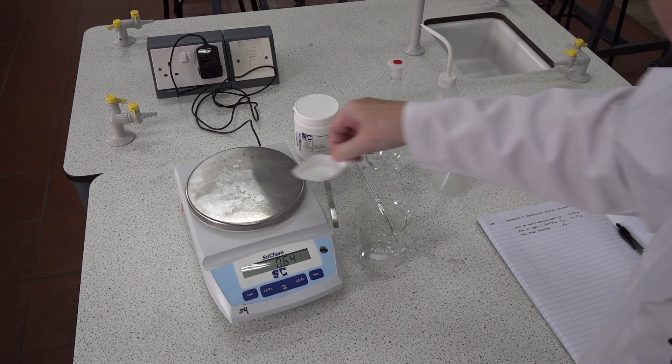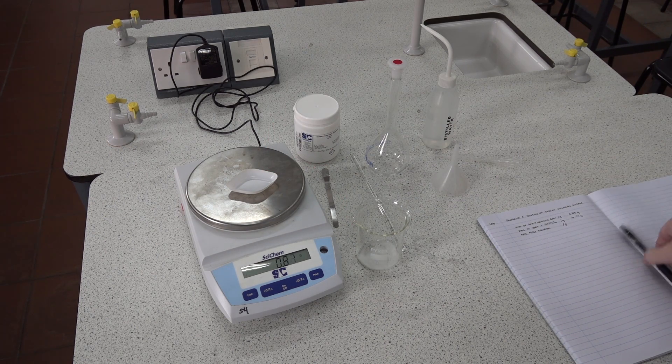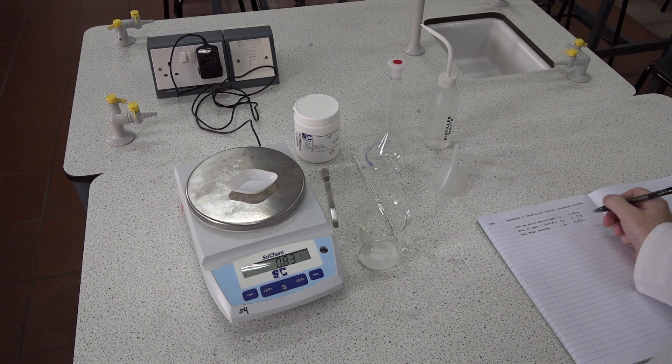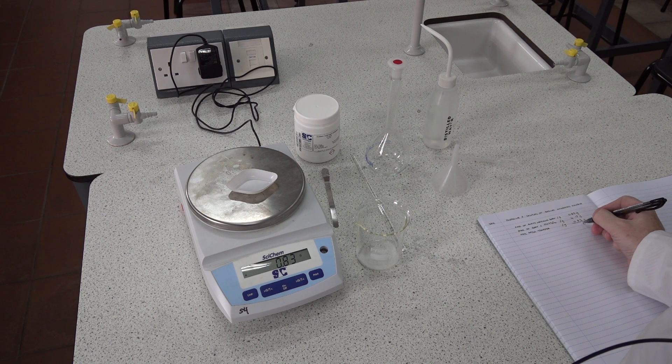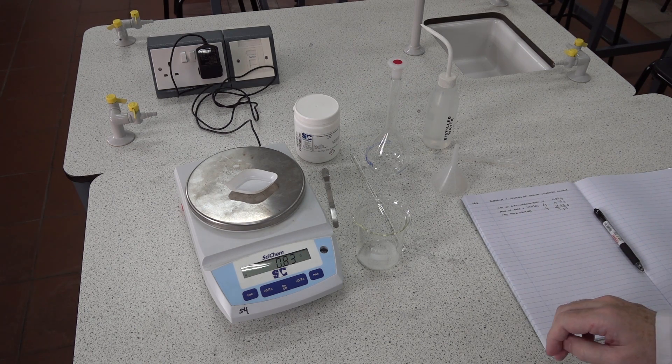We then put the salt into the 250 mL beaker and we weigh the boat back to confirm our original mass: 0.83 grams. By subtracting the mass of the empty boat from the previous weighing, we get the mass of salt transferred: 3.30 grams.